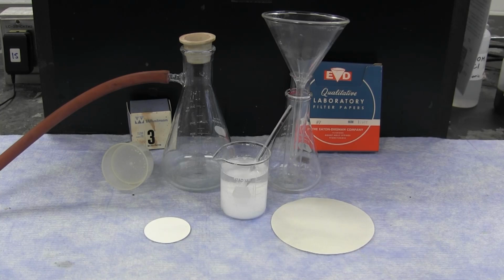These two properties will dictate whether the liquid will pass through it very fast and leave behind some of the particulate matter that will go through, or will it pass very slow but make sure that all of the solid and all of the particulate matter is captured by the filter paper and left behind.